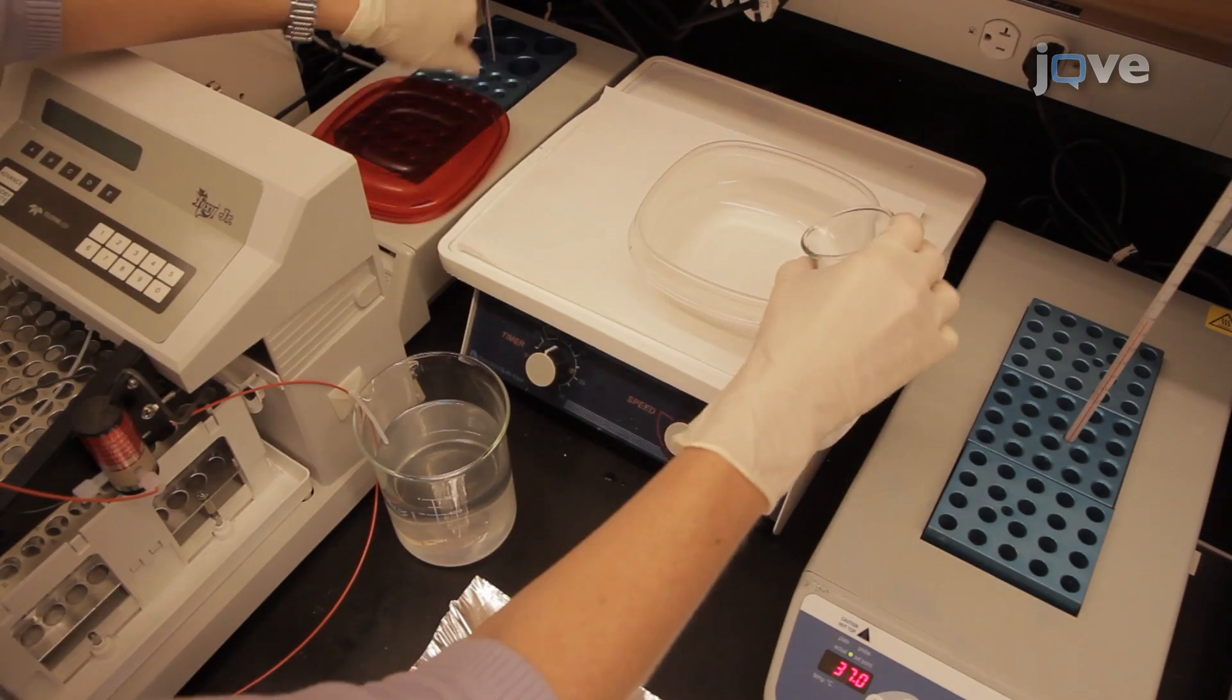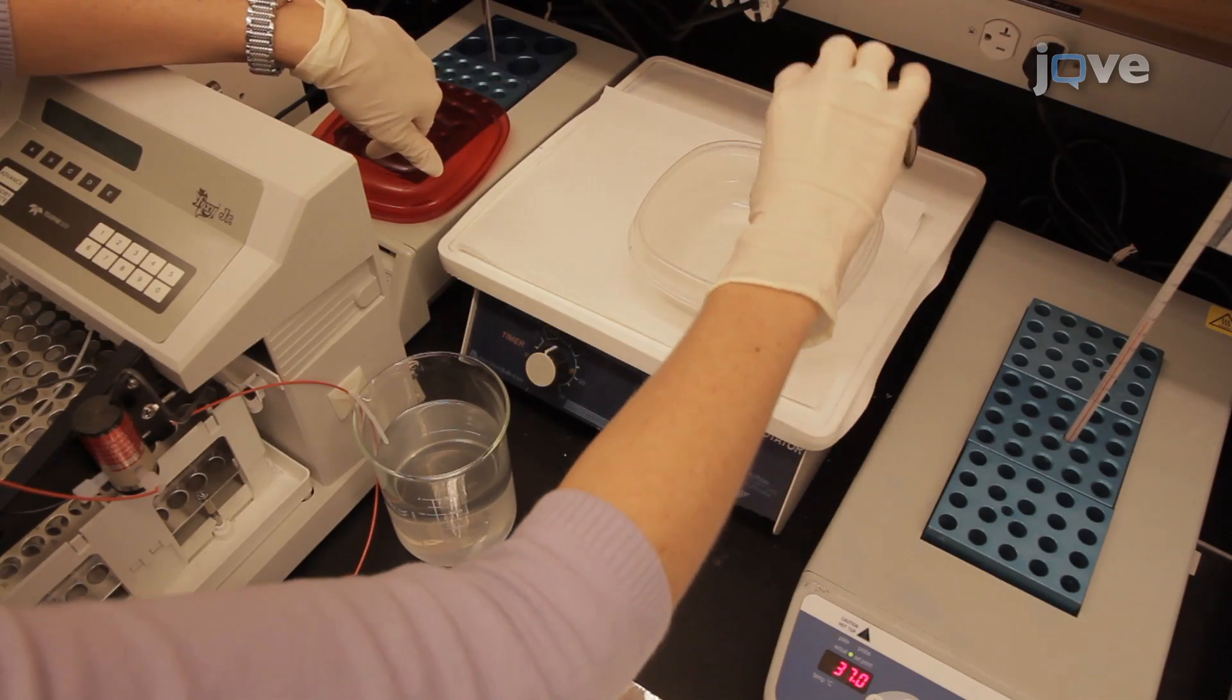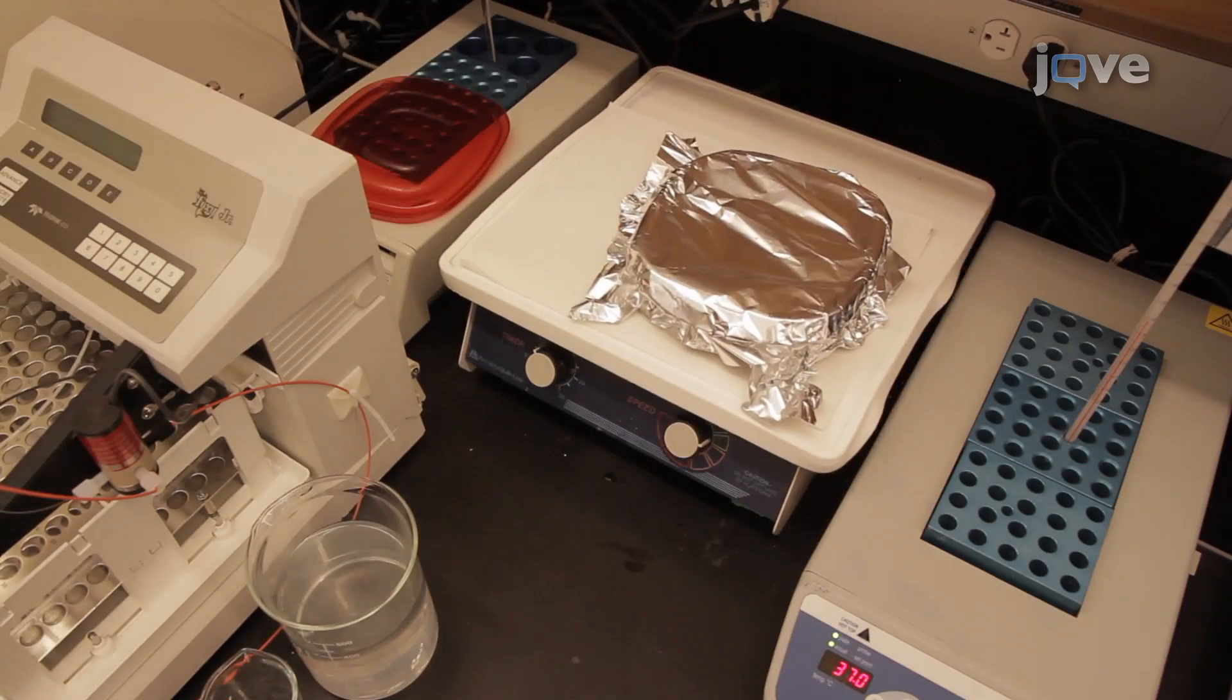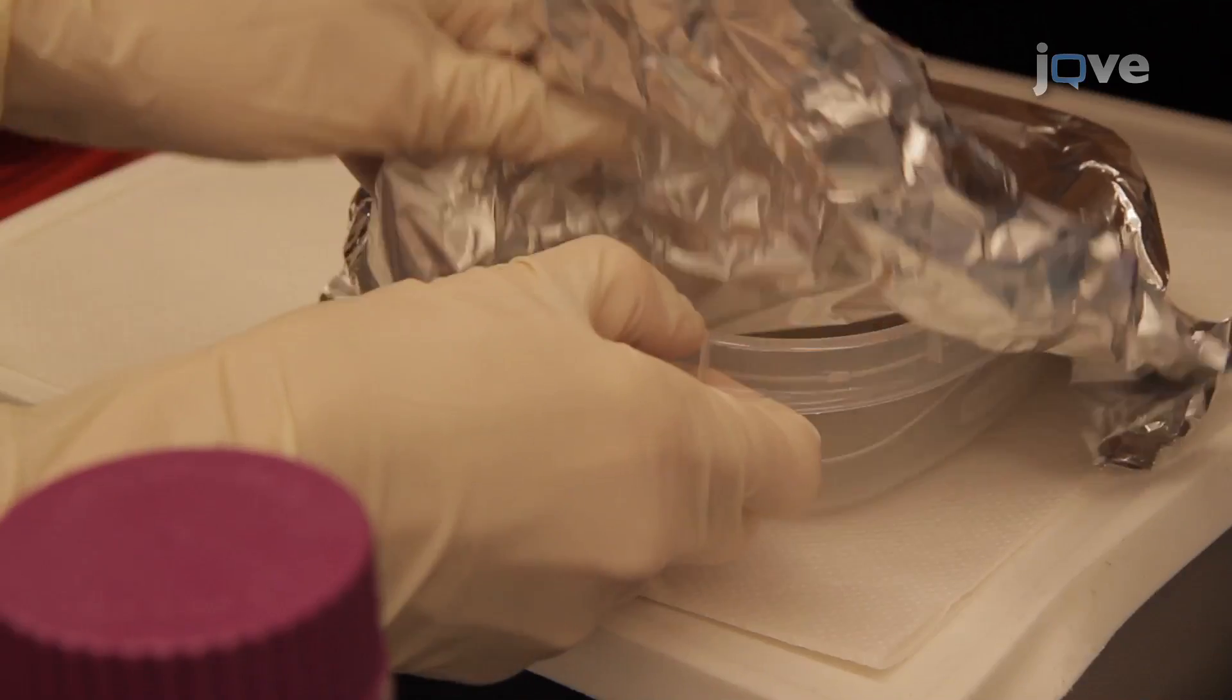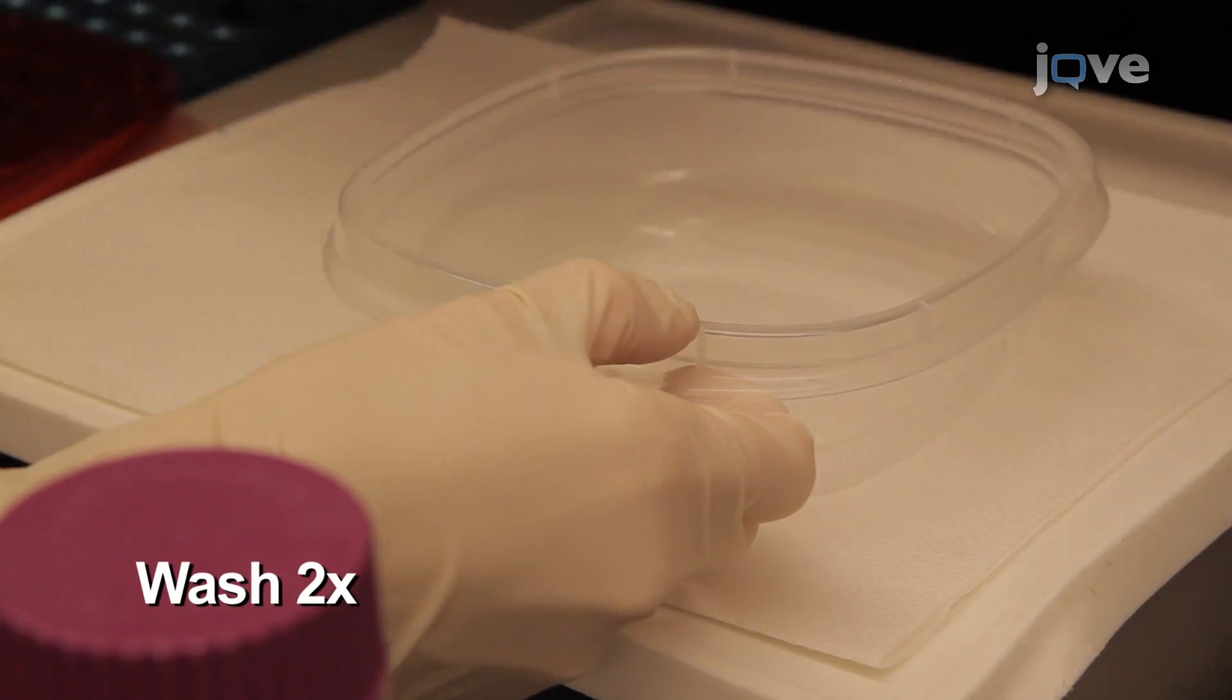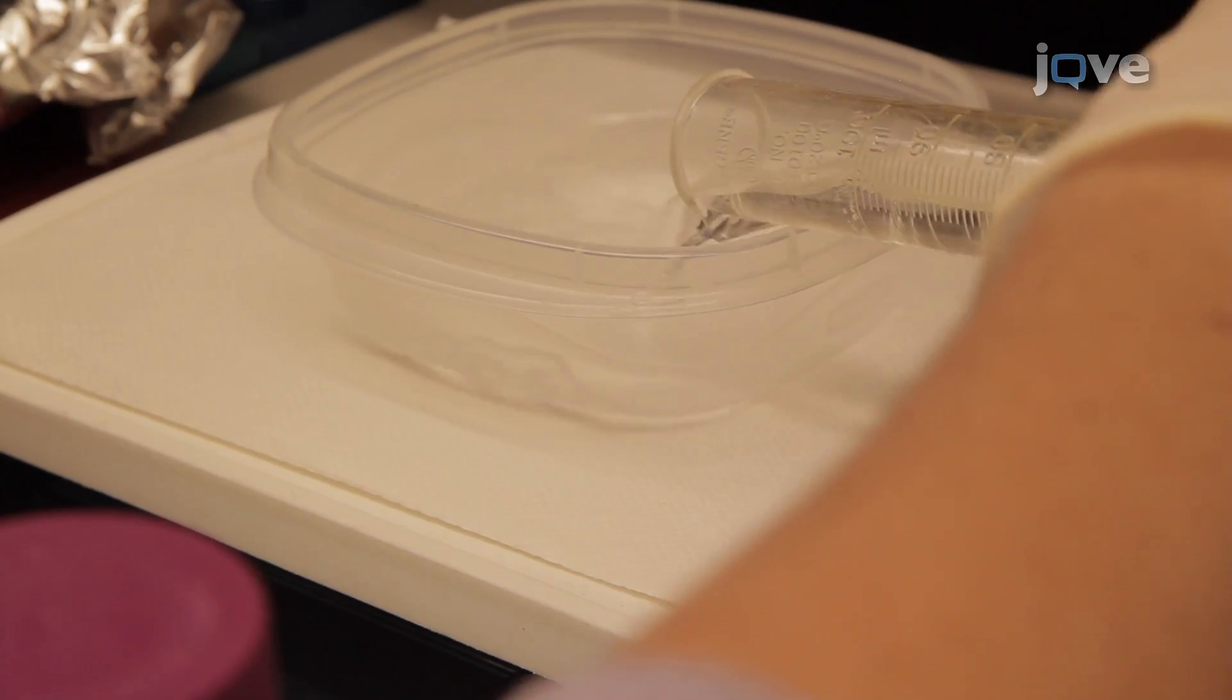Stain the gel by incubating in the prepared stain under dark conditions with gentle agitation for 90 to 120 minutes. Subsequent to gel staining, repeat the two wash steps as described earlier.